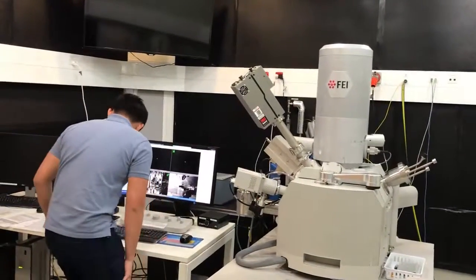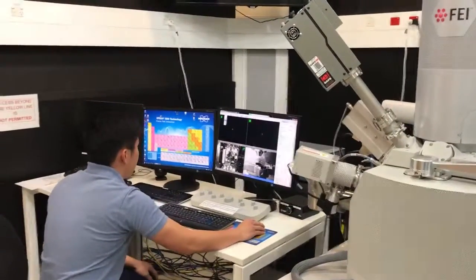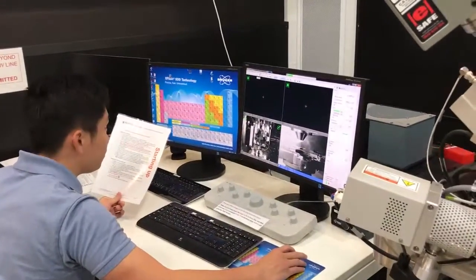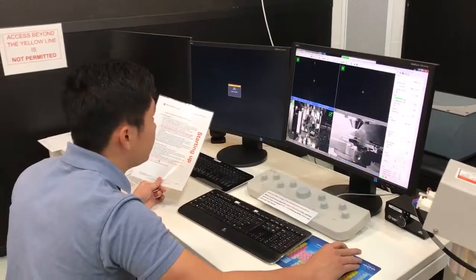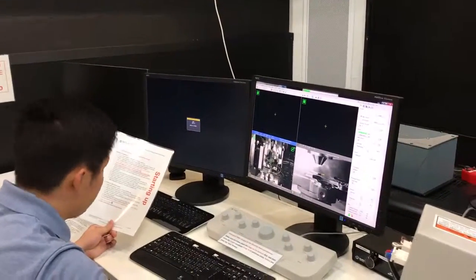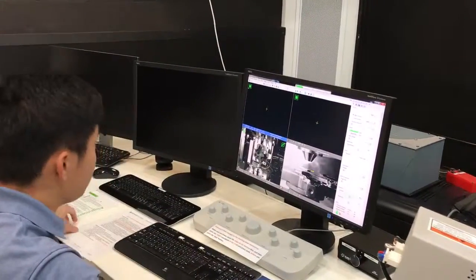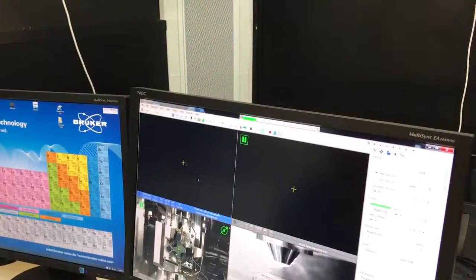So for this secondary electron imaging, I will be using 5 kV accelerating voltage, spot size 2. Okay, take a note of that, people. He's using 5 kV electrons for secondary electron imaging. So select the secondary electron detector. When you see a pause sign in this quadrant, the quadrant is being paused, and you need to unpause it to get the live image.